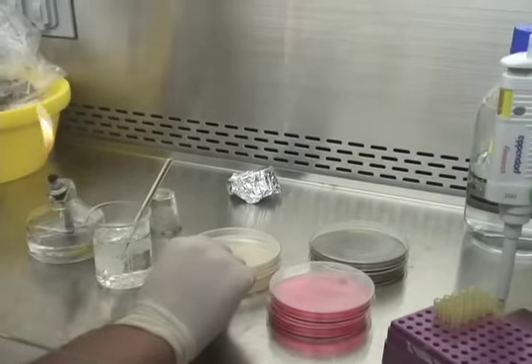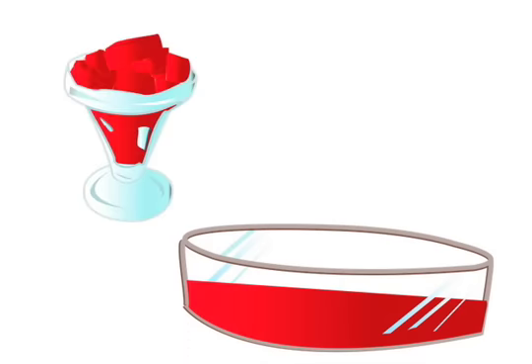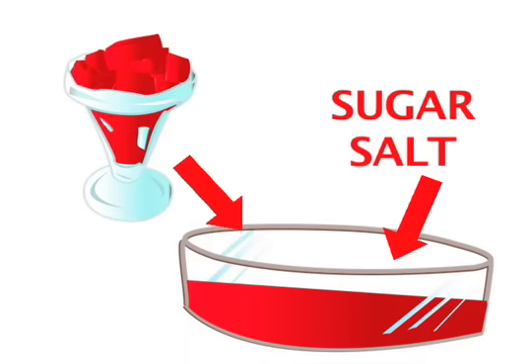What we have here in these petri dishes are various media that we're going to grow the bacteria on. You can think of it as jello for bacteria. It's got a bunch of sugars and salts and everything you would need if you were a bacteria.